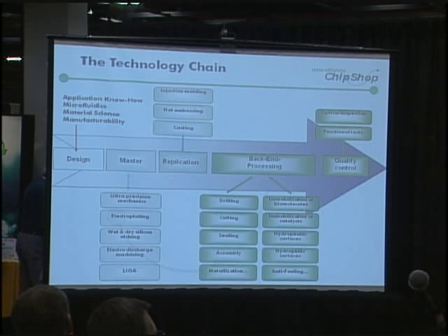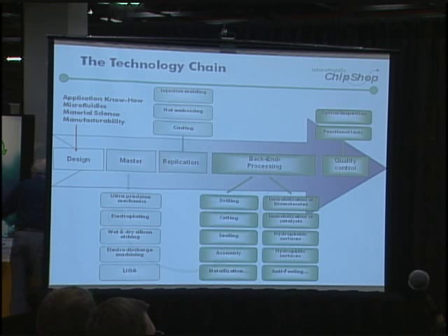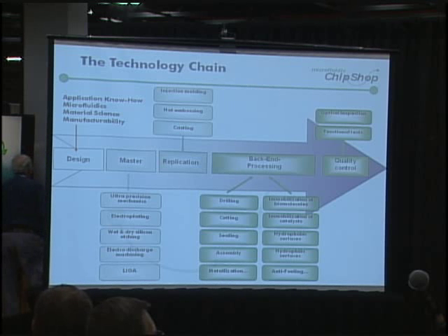As we're talking about polymer replication technologies, the next step then is to make a replication master, which is a mold insert, the geometrical inverse of your final structure. And we typically prefer to do that with ultra-precision mechanical machining, which nowadays goes down to about, in theory, 10 to 15 micron. In reality, if you take tool wear and stuff like that into account, more like 30 to 50 micron. But it can make arbitrary heights, three-dimensional structures, so that's our preferred method.